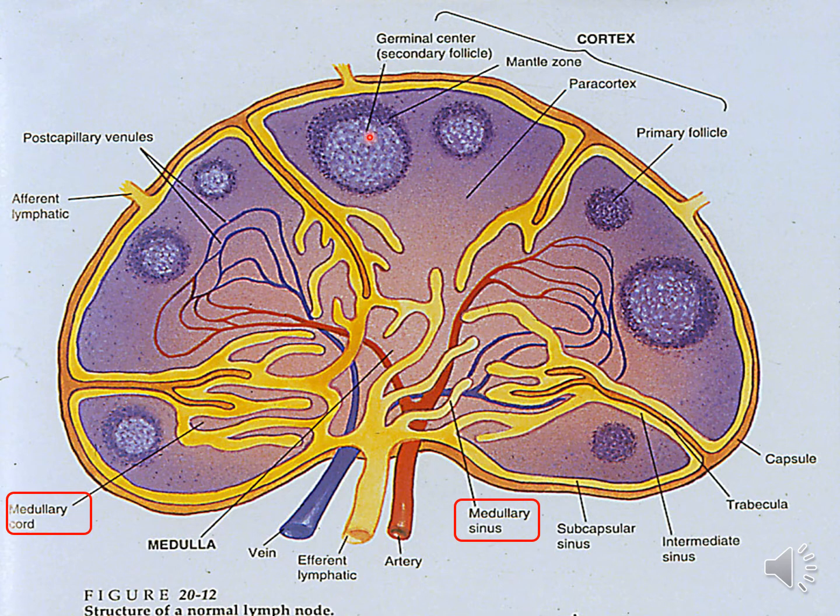We have talked about how it has a central zone and a marginal zone. These lymphatic nodules are present in the peripheral part of the lymph node, and we name this area the cortex, and the rest of the central portion we name the medulla. And the junction between the cortex and the medulla, which is not a very clear margin, we name the paracortex. Paracortex means parallel to the cortex. So we can say that the paracortex is the junctional area between the cortex and the medulla.